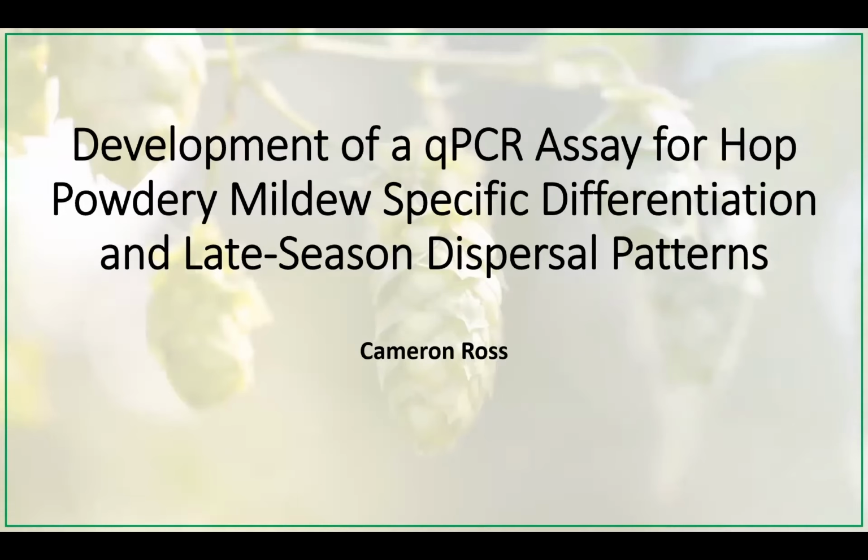Today I'm going to be talking to everyone about the development of a qPCR assay for hop powdery mildew, specific differentiation, and then how we can use that to understand late season dispersal patterns. So I will go ahead and give you a little bit of a brief introduction here.